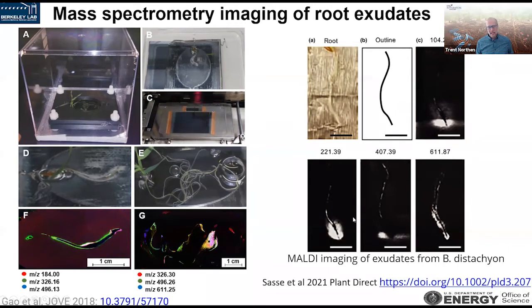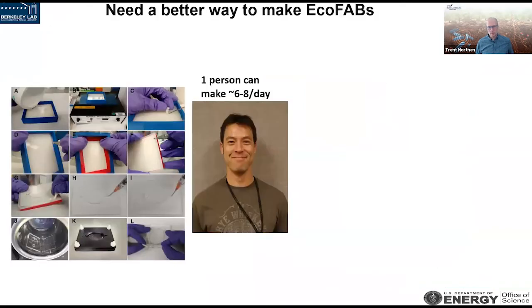And I would just say that this is something that a collaboration or a user project with EMSL would really benefit by, because EMSL has really exceptional capabilities in mass spectrometry imaging. So we found so many different uses for these EcoFAB devices.